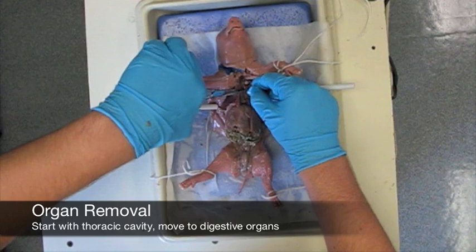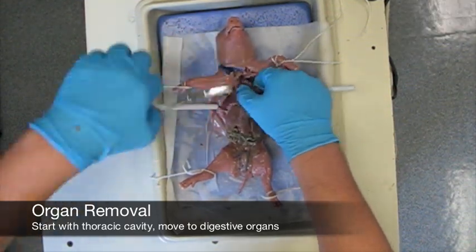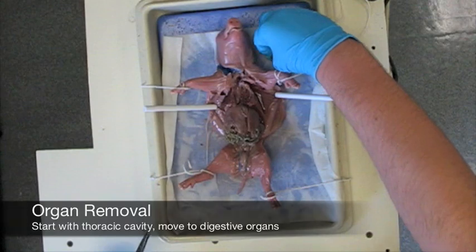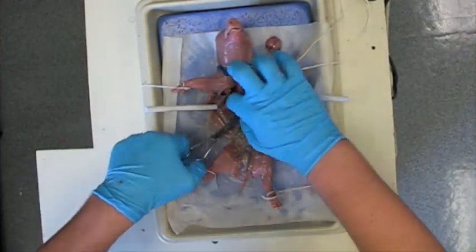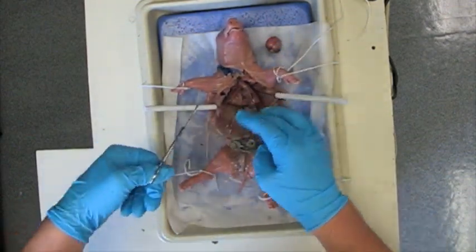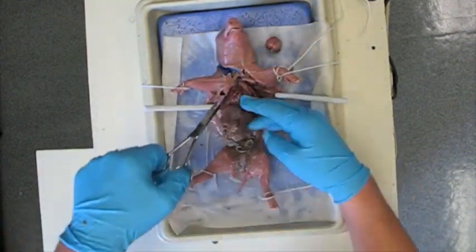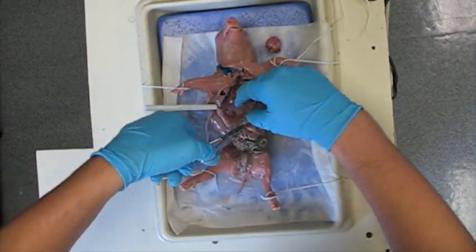At this point in the dissection, we begin removing the visible organs. If you would like, you can take them out, cut them open, and examine the inside tissue. Remove the organs one by one by severing the connective tissue, and then place the organ on your dissection tray. Once you are done, you should be able to see the backbone, kidneys, the sex organs, and possibly the spinal cord.